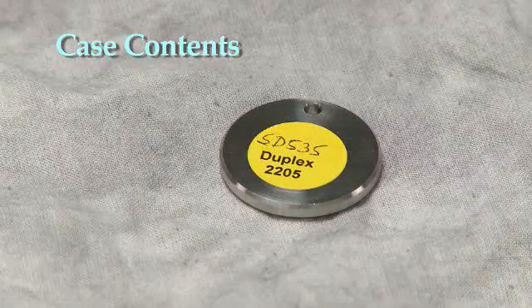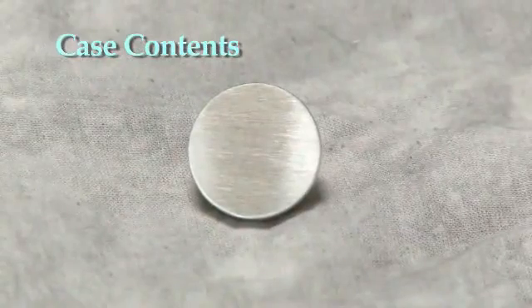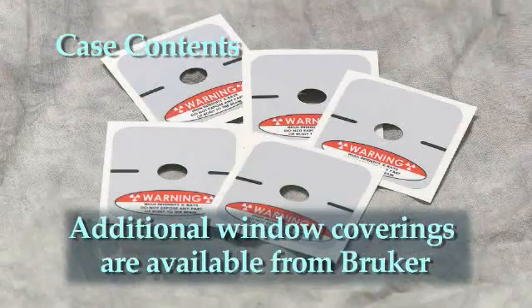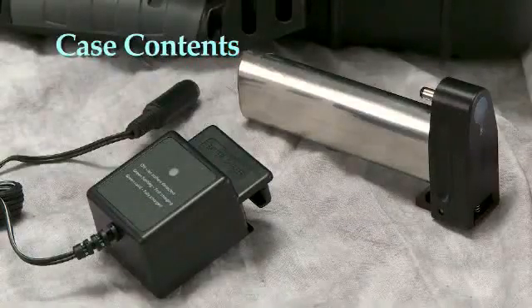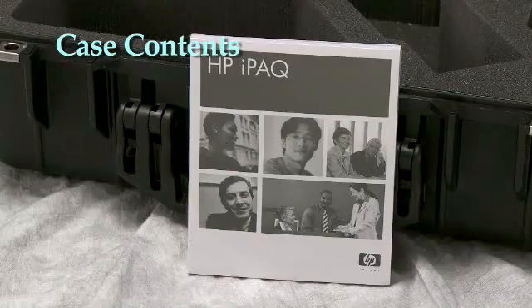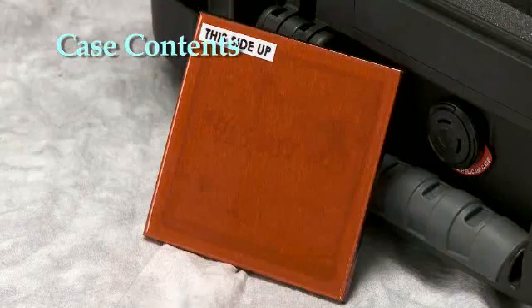A 2205 check sample to confirm the calibration of the analyzer. An aluminum check sample which can be used to further verify the light element calibration of the analyzer. A kit of five replacement windows — these protect the analyzer from dirt and contamination. An SD card to store data and a USB-based media reader to transfer data from the analyzer to a PC. A lithium ion battery charger. A Hewlett Packard PDA with user's manual. A rugged PDA cover. A background scatter plate.